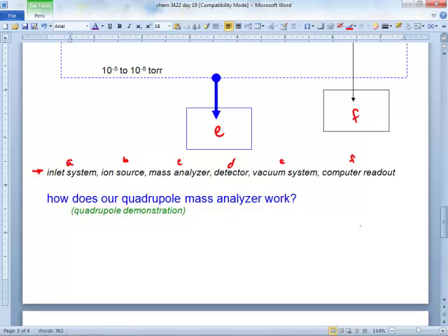So now bring all that stuff back, right? So she got a nice peak. Now this guy is scanning to probably a heavier mass, right? No, it's too heavy. So that one gets sucked up.